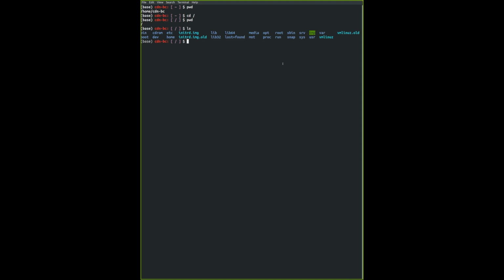By the way, you can change the aesthetic of your terminal if you go into preferences on your Mac. I don't think Windows has it; you need a different preference section. But on Mac, you can configure a dark theme or light theme, change the font size and all.